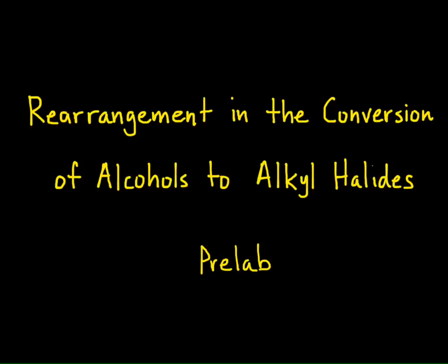This is the prelab for the experiment entitled Rearrangement in the Conversion of Alcohols to Alkyl Halides. Both alcohols and alkyl halides are important functional groups due to their versatility as starting material, being able to transform into numerous other functional groups. In this experiment, we will look at the transformation of alcohols to alkyl halides and how the structure of the alcohol can determine potential rearrangement when forming the alkyl halide.